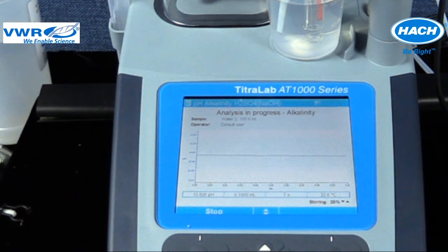The methyl red, methyl orange, or total alkalinity is determined by an endpoint of a pH of 4.5. This portion of alkalinity is arbitrarily attributed to the hydrogen carbonate and hydroxide concentration of water. The concentration unit for alkalinity is reported as calcium carbonate, or CaCO3. The number of detected equivalent points depends on the initial pH of the solution. By definition, p-alkalinity is zero for water which has a pH value of 8.3 or less.